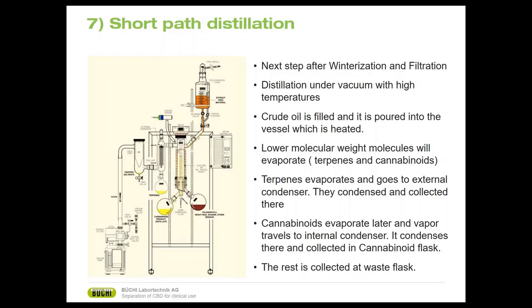Both methods have some pros and cons, like the extraction. In this case, if you want to run higher output, you can go with the falling film system. It has higher volume capacity, but you have to run the system twice because you can set the temperature to only one value.